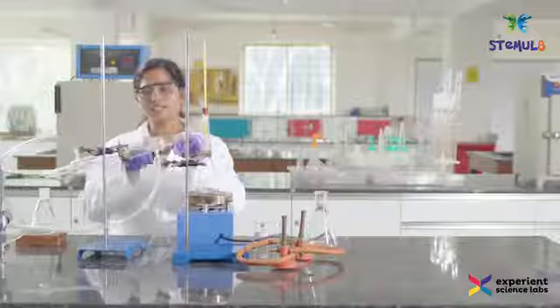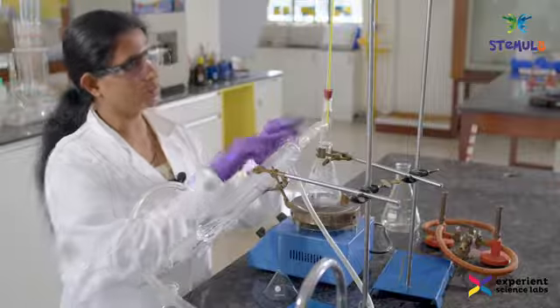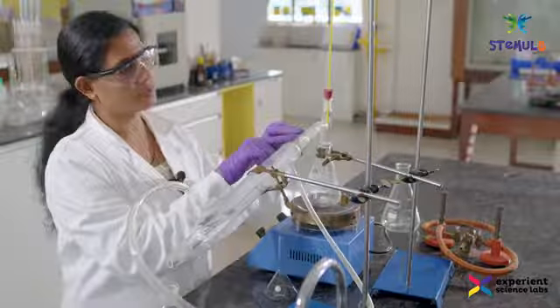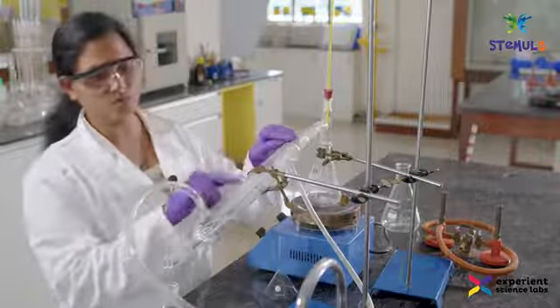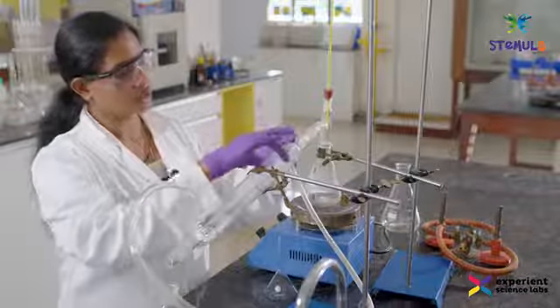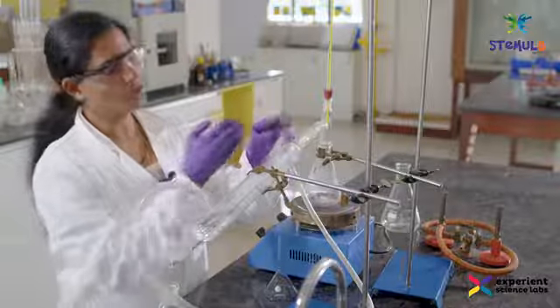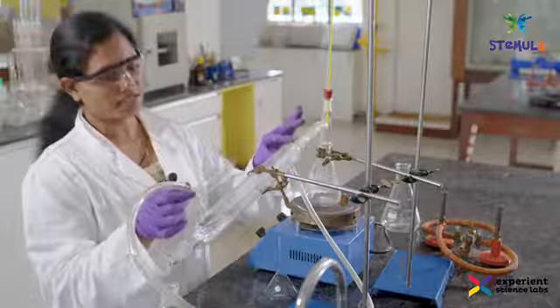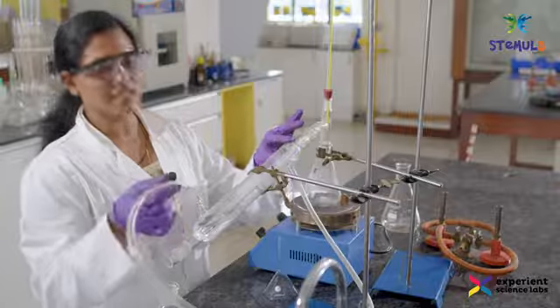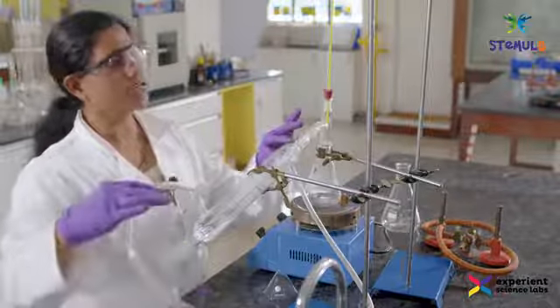The condenser consists of two tubes: an inner tube through which the hot vapors enter from the top and move towards the bottom, and an outer tube through which water enters from the bottom upwards. This water is passed through water pipes which are in turn connected to a tap.